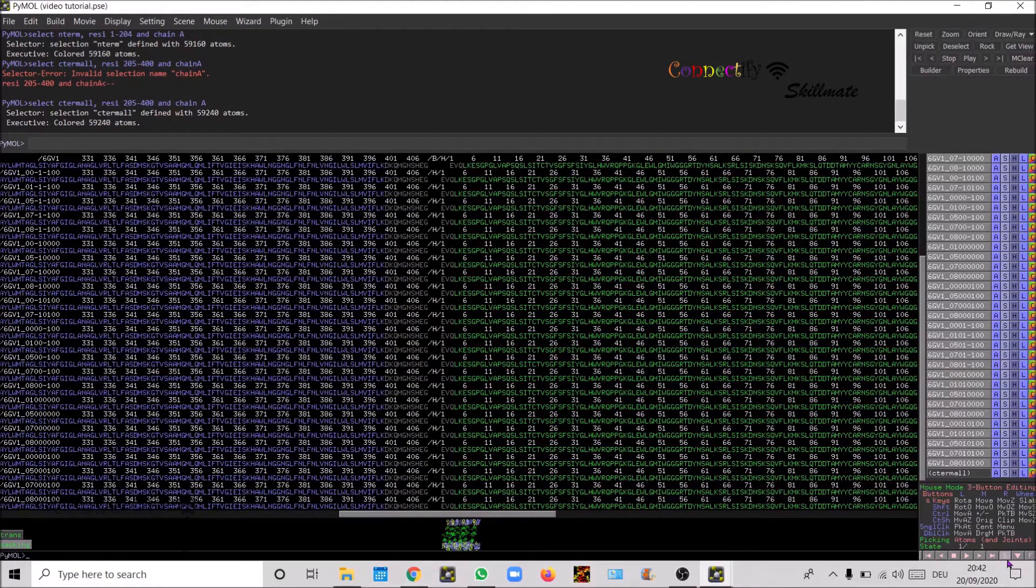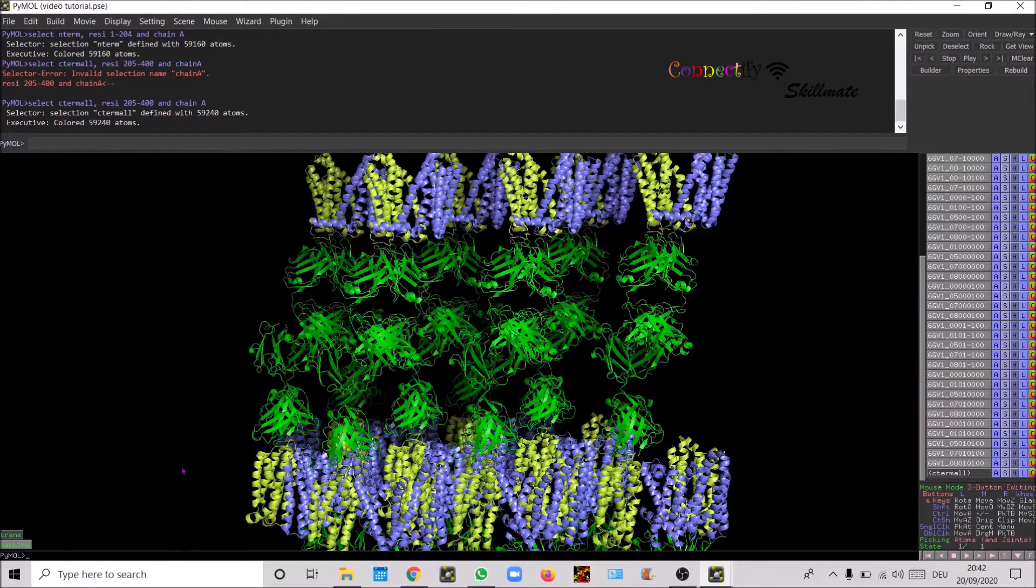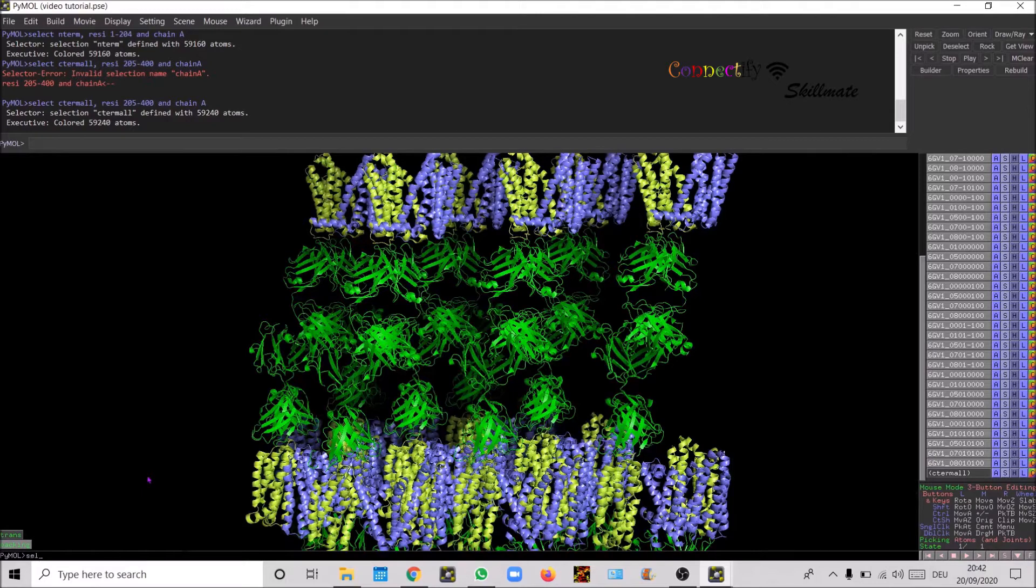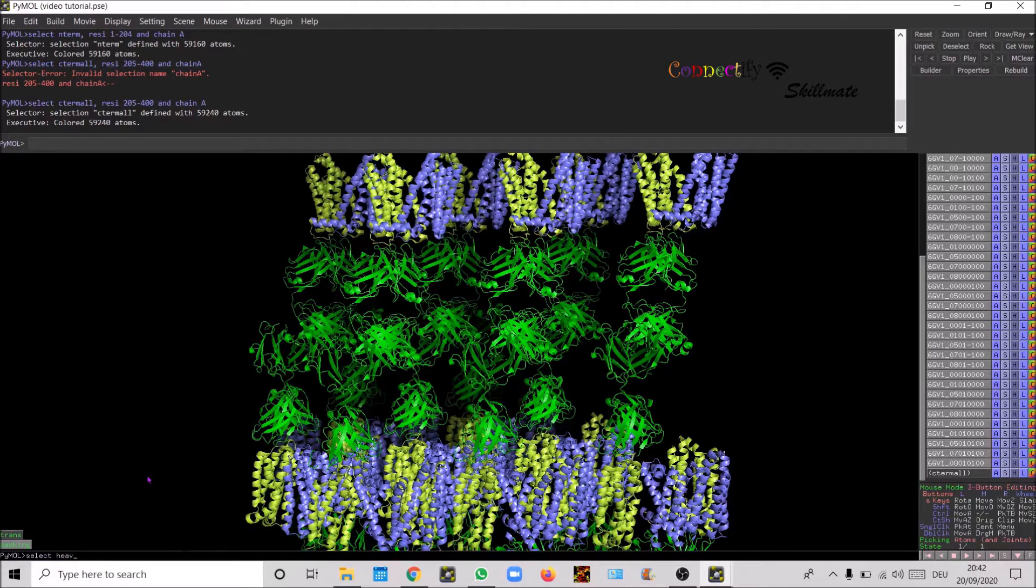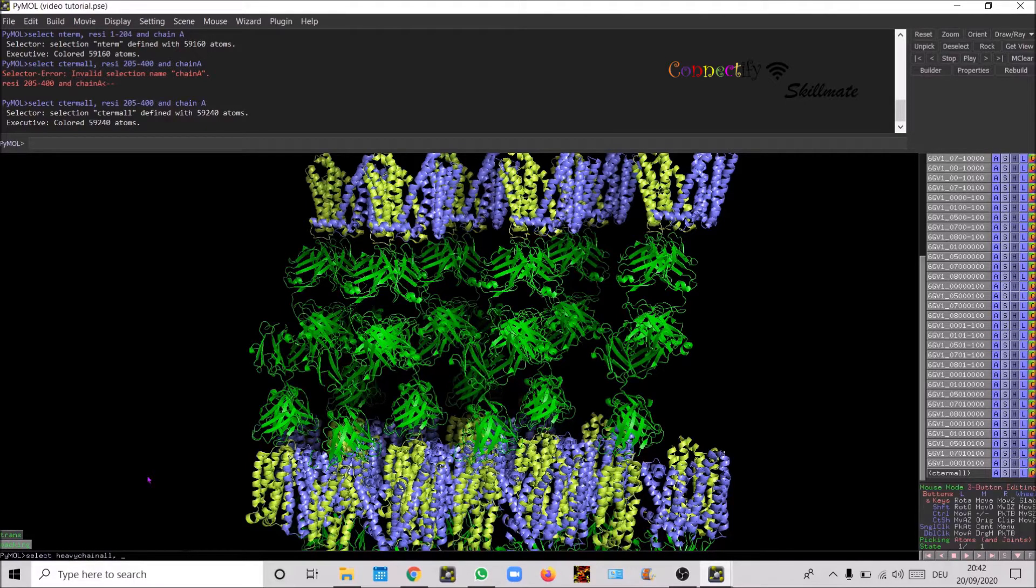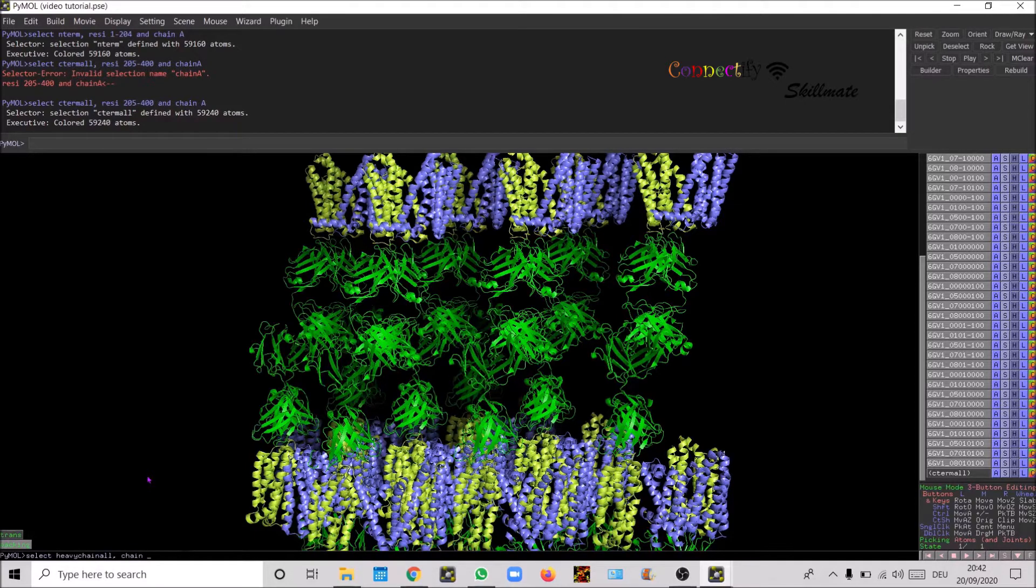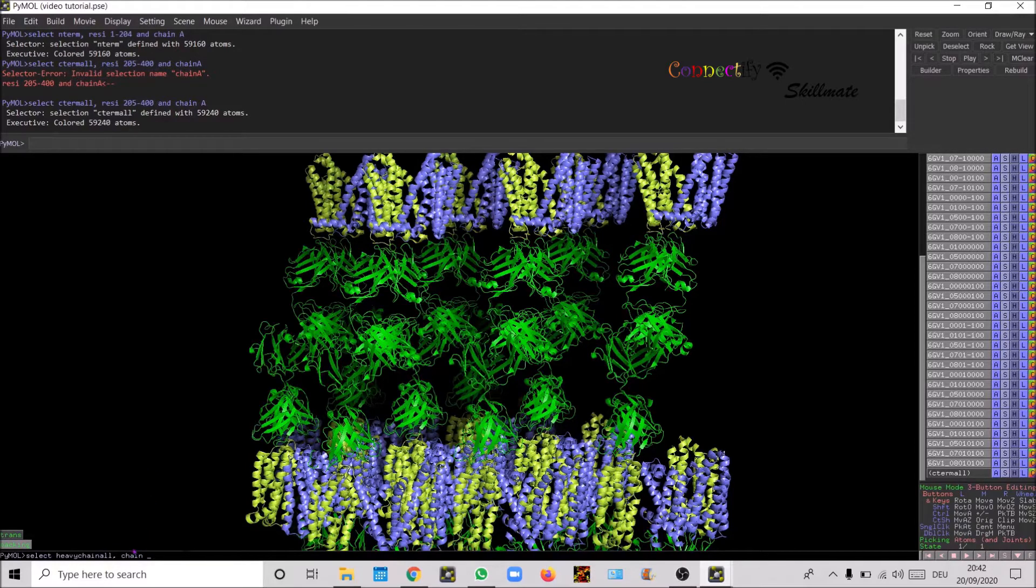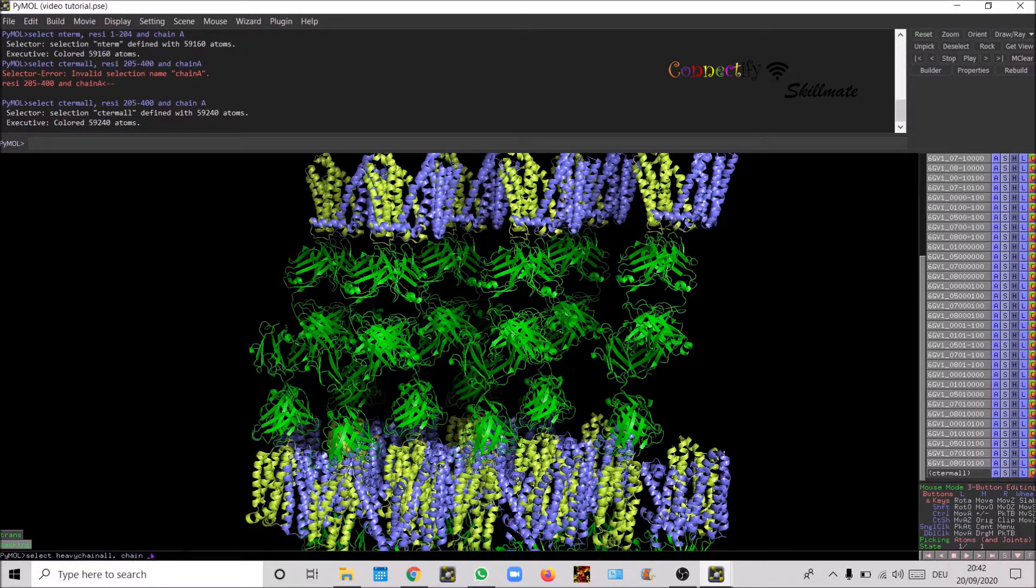Close the sequence and then we're gonna define selection. Let's say heavy chain all. Chain, chain, chain. Since the chains have been defined separately we don't need to really specify the residue number. You can leave that out and then just specify only the chain here.